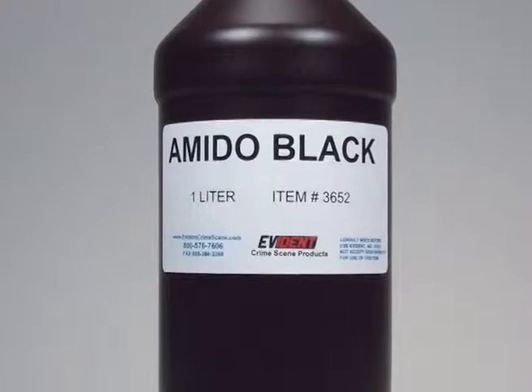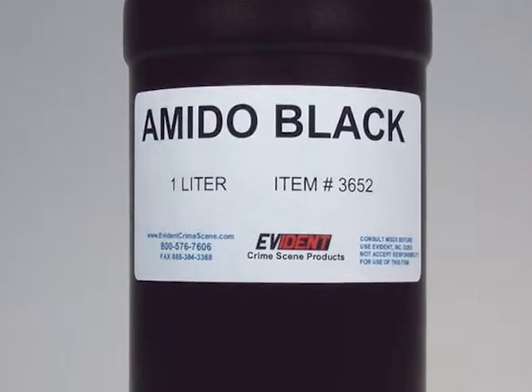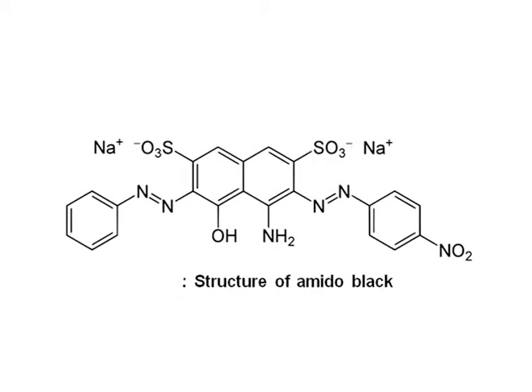The following protein reacting reagents have proved efficient in detecting blood fingerprints. The very first reagent which reacts with the protein moiety is amido black. While using amido black reagent, the structure of which has been shown on your screen already, 3 solutions need to be prepared. Solution A, or the very first solution, contains amido black 0.2 grams dissolved in a mixture of methanol, that is 90 ml, and glacial acetic acid around 10 ml.